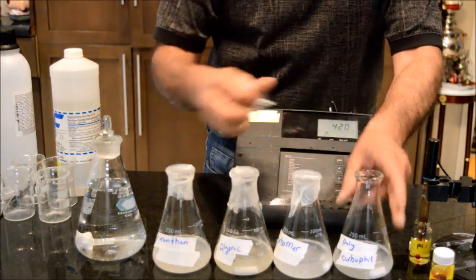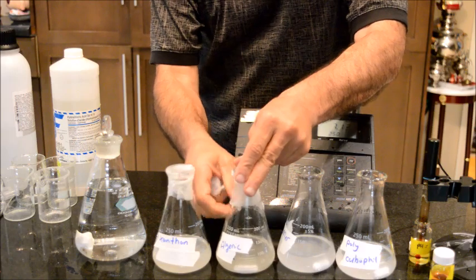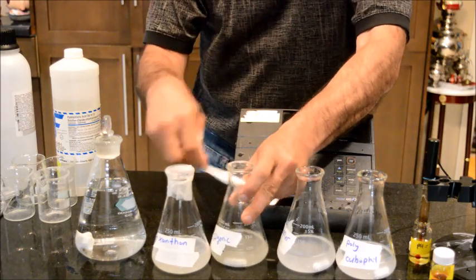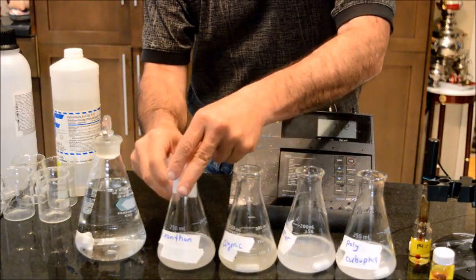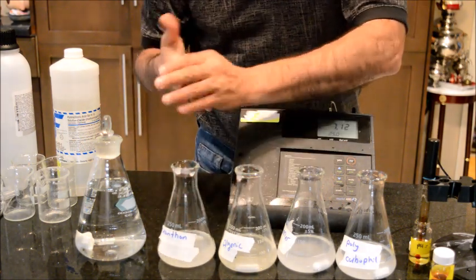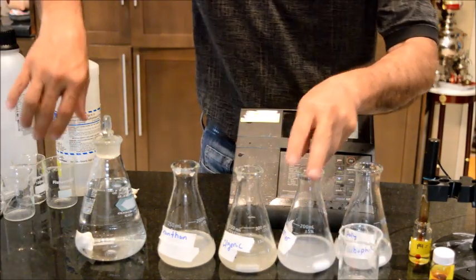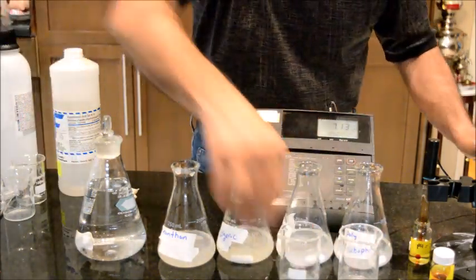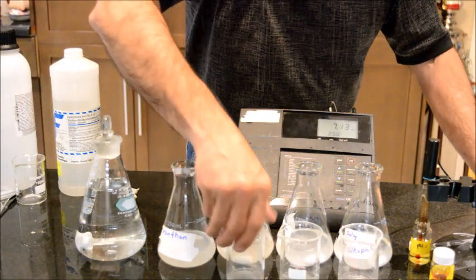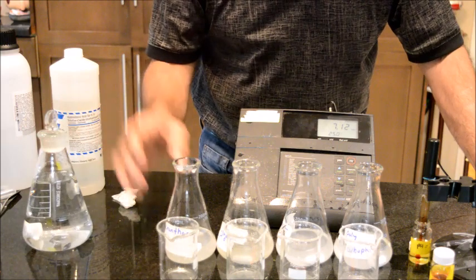Take these off one at a time. Because there's too much gelling material I have, I'm going to transfer a little bit in a beaker. I'm not going to adjust all of the solution that I have. I'm going to just transfer a little bit of each in a beaker, and I will just do the adjustment in there.